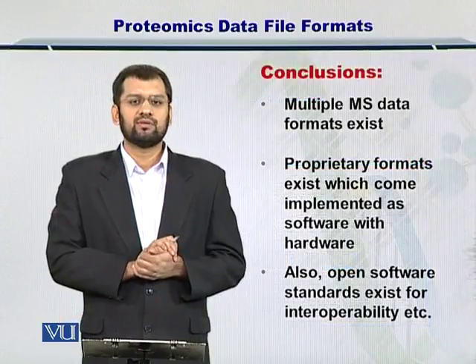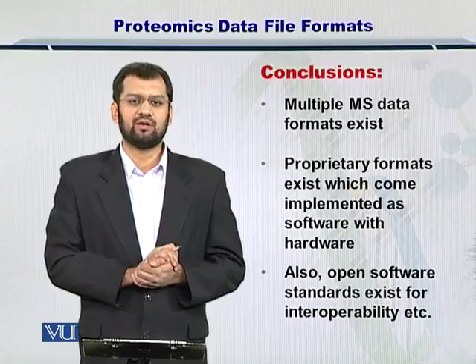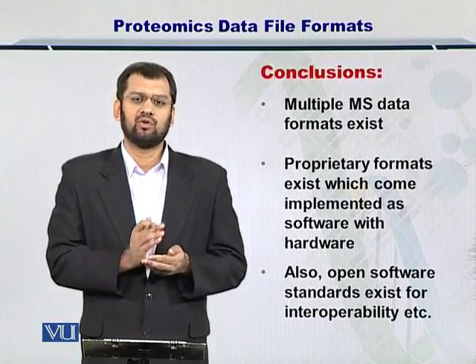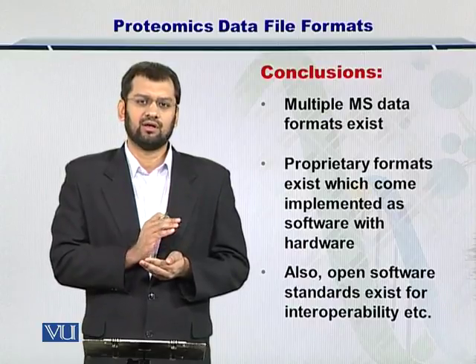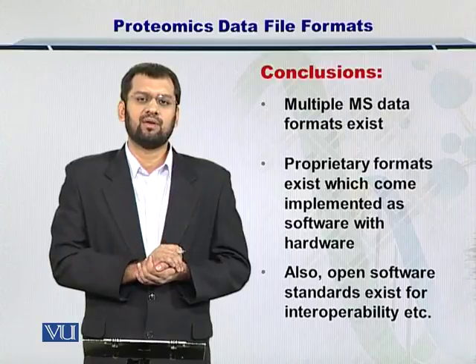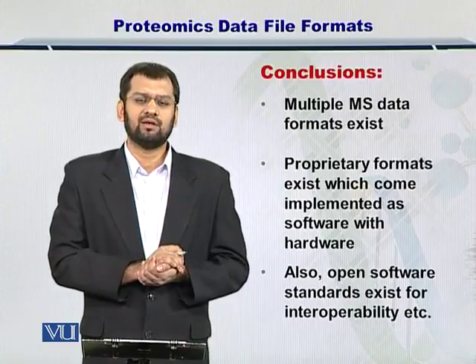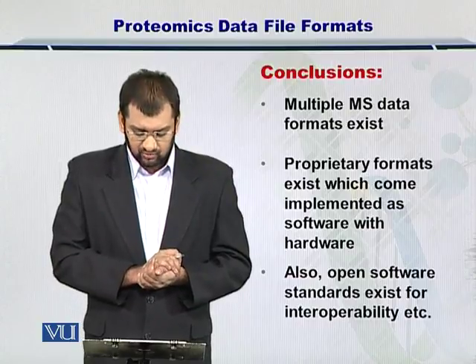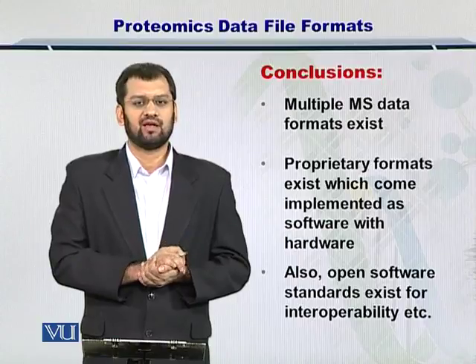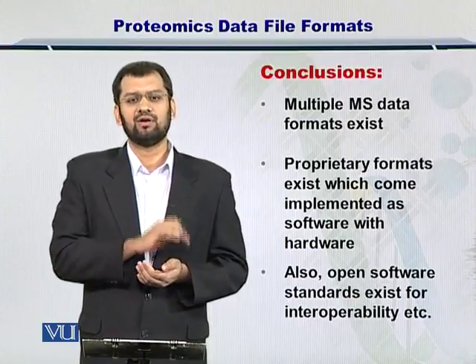So in conclusion, multiple data file formats exist from each vendor, instrument manufacturer, and you can look at each one of the data formats that are output and convert them into open file formats which are readable by the eye. And also several interoperability standards exist, such as MZXML, which can help you to translate data between two different instruments.